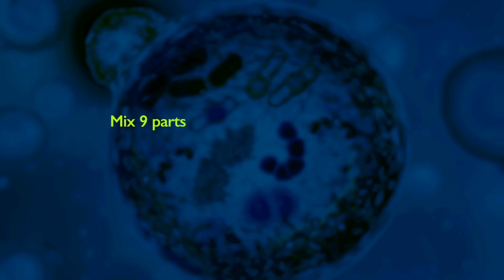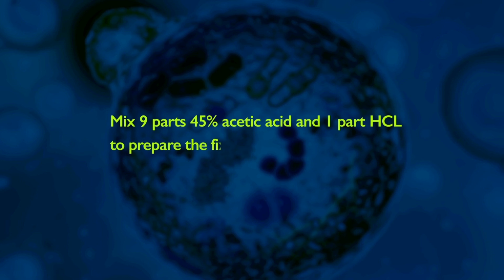Next is fixative preparation. Mix 9 parts 45% acetic acid and 1 part HCl to prepare the fixative.